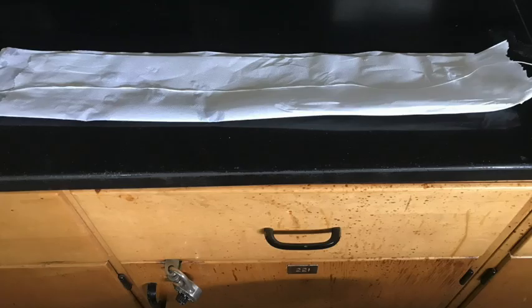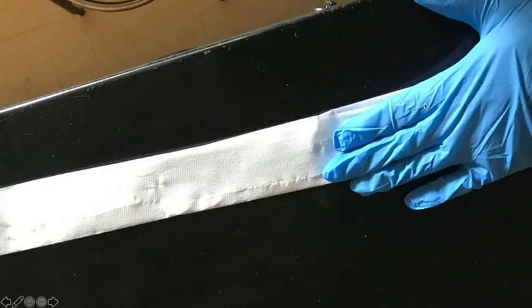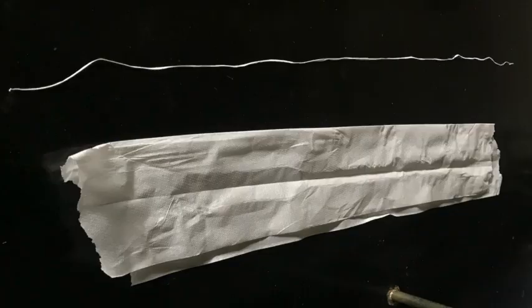Now we'll collect and analyze some data from our nylon synthesis. I have the nylon on this piece of paper towel to help dry it because it's wet with water and cyclohexane. I'm doing this on the bench by locker 221. Whose locker is that? 221, I'm using your bench, thanks. So I folded the paper towel over and I'm drying it off. And I didn't show it, but I actually rinsed it off with water first to rinse off the excess reagents and things. And then I take it out of the paper towel and it's pretty dry.